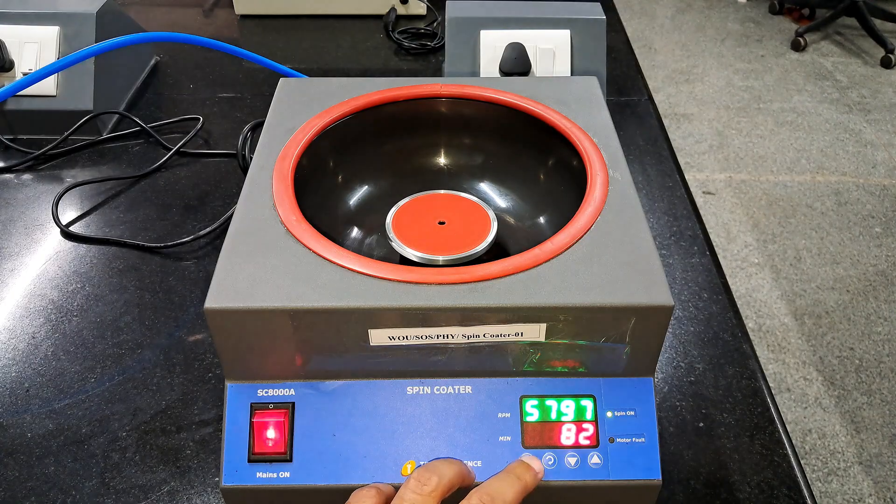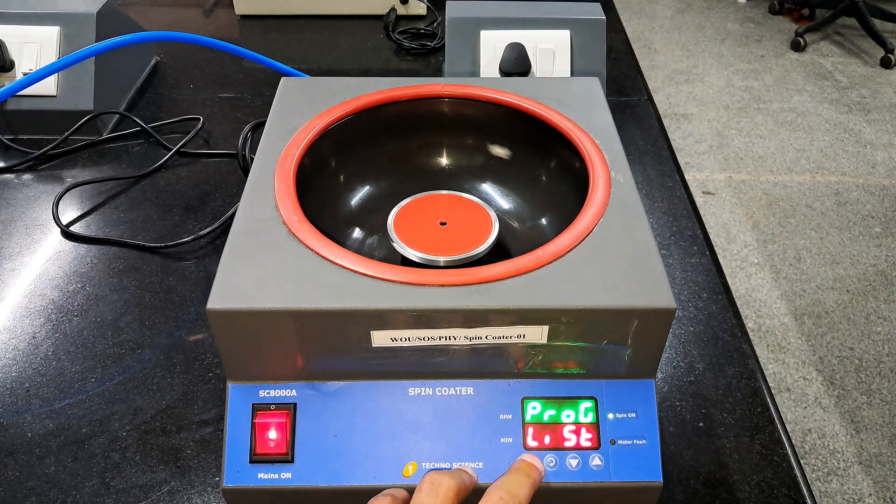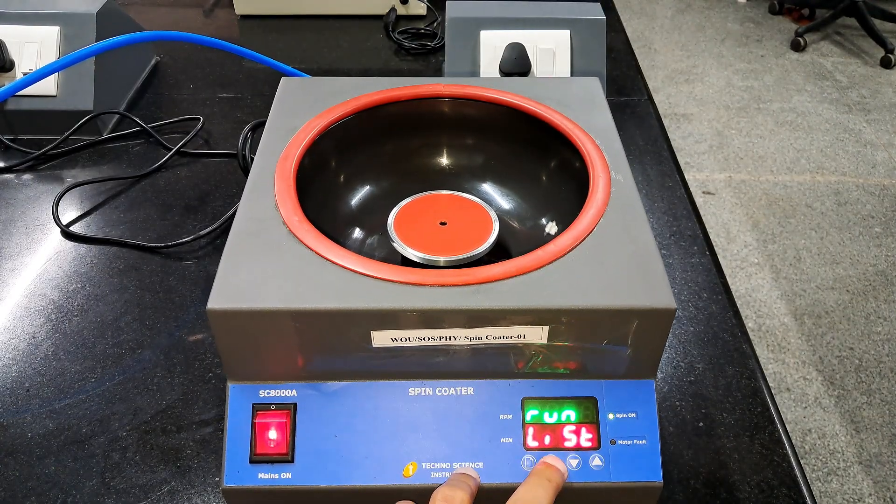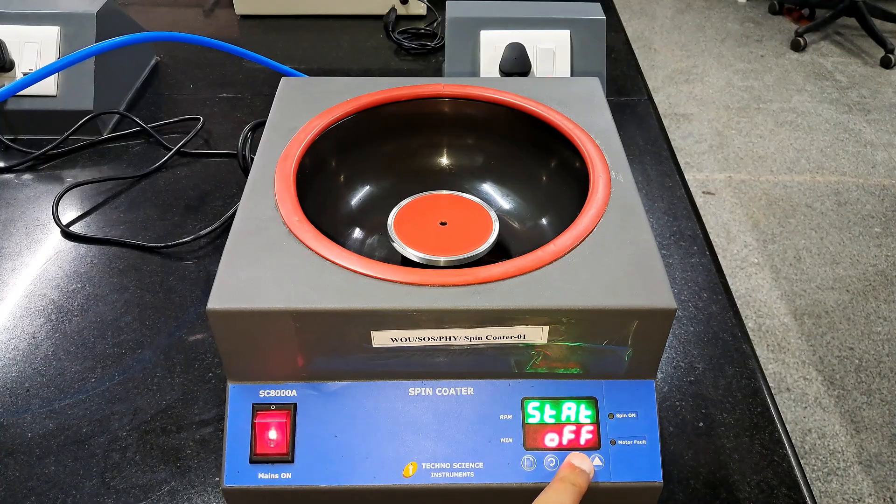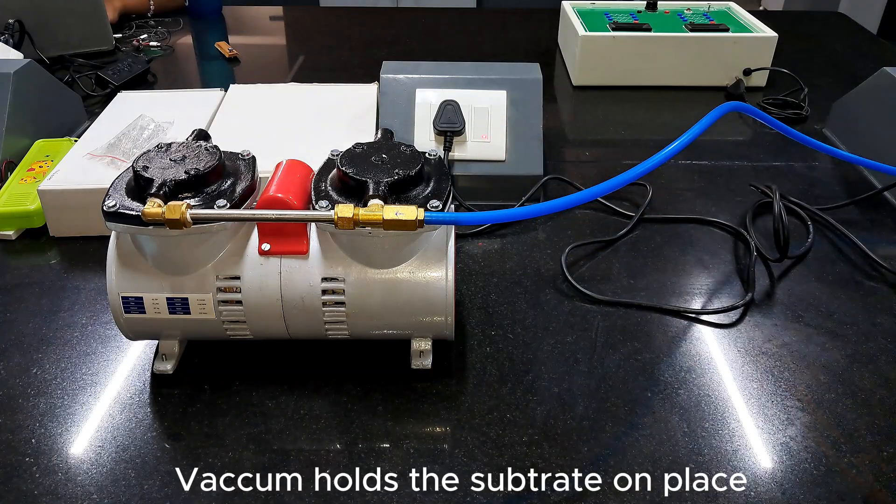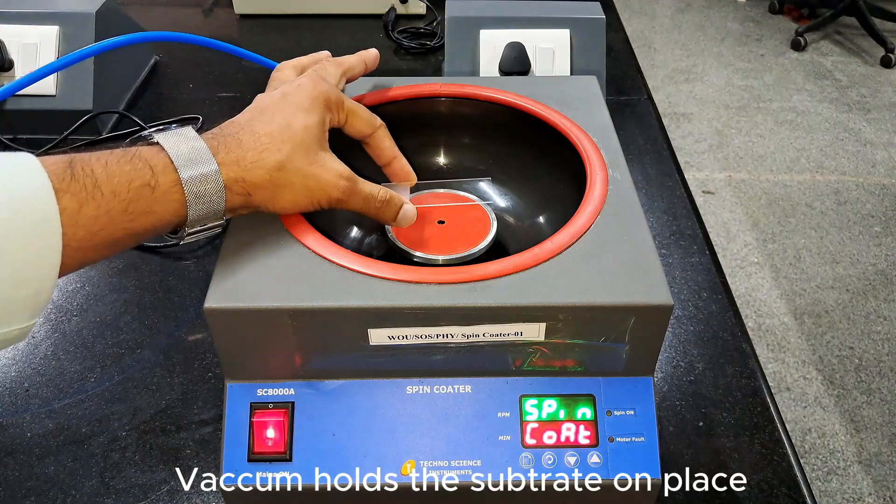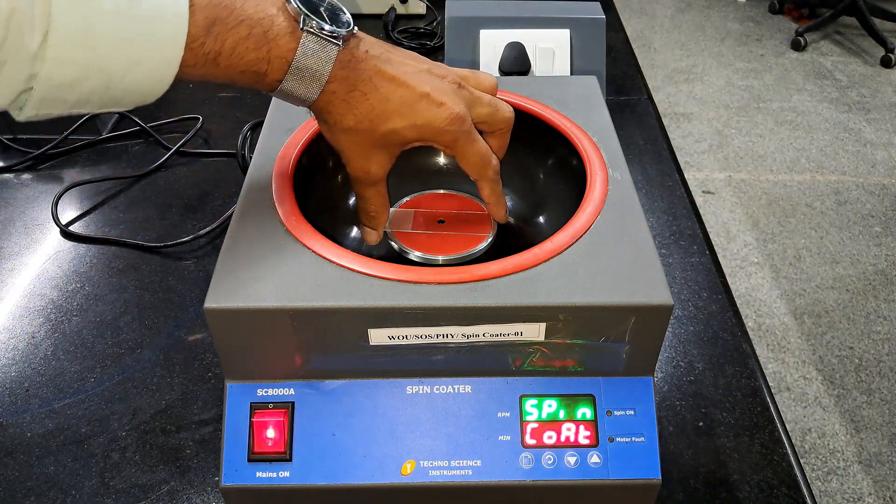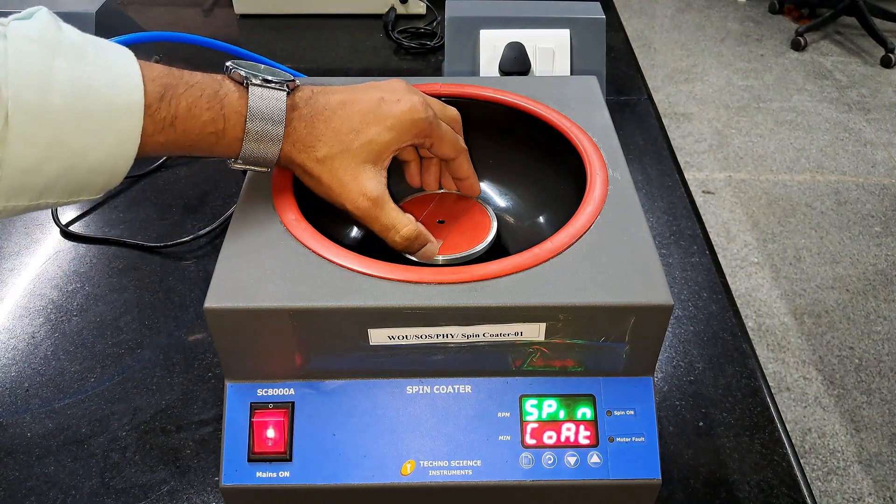We can stop the program in between by pressing run list start run start off. The purpose of vacuum is to hold our substrate. It has a rubber pad to provide the strong grip.